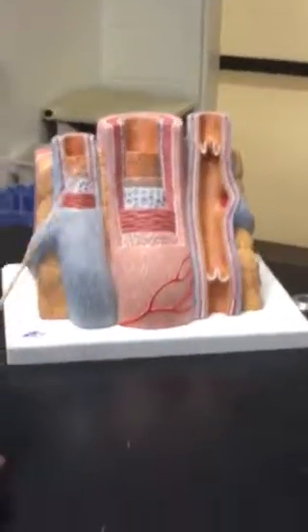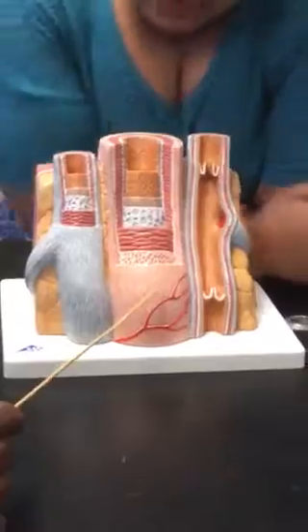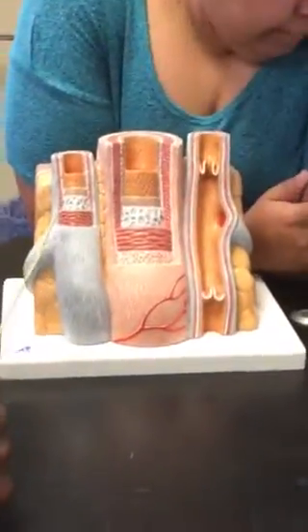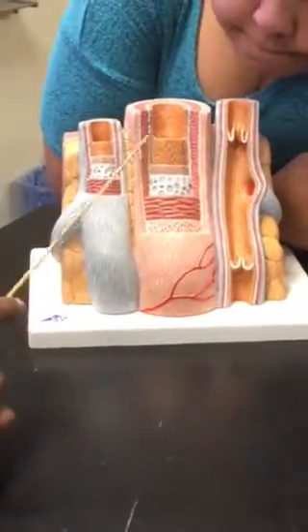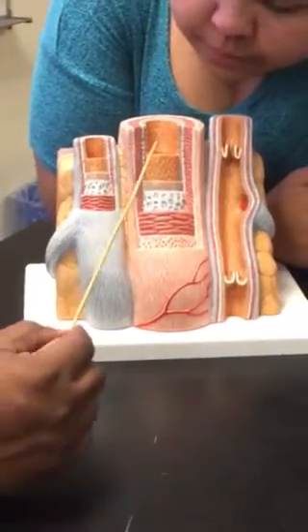Now we have three vessels here. Of course, two are veins, and one is an artery. Clearly, we could see that this one is the artery and the other two are veins, right? Now let's go through the basic layers.